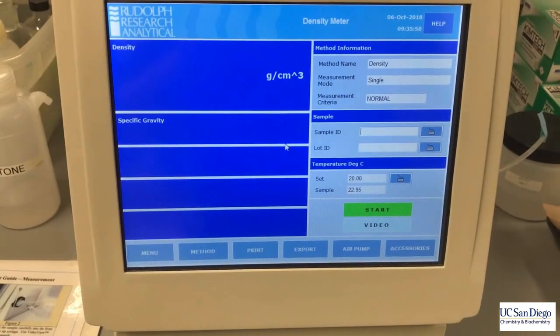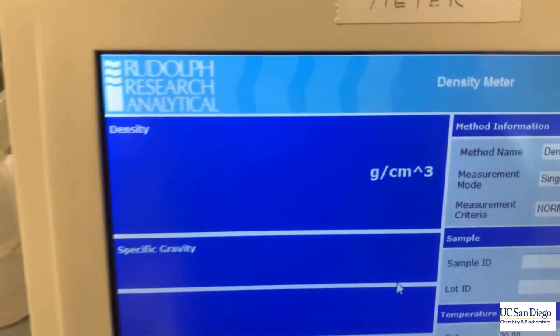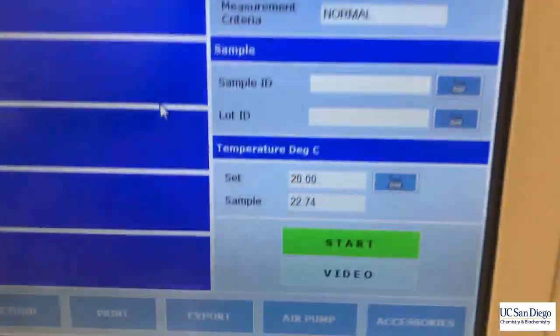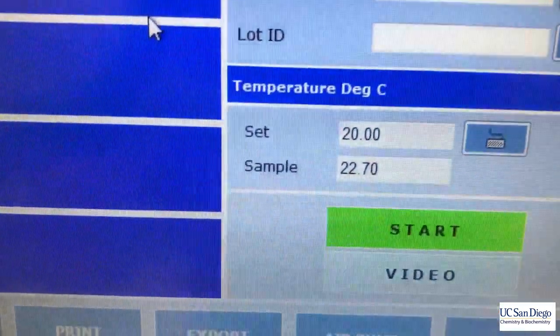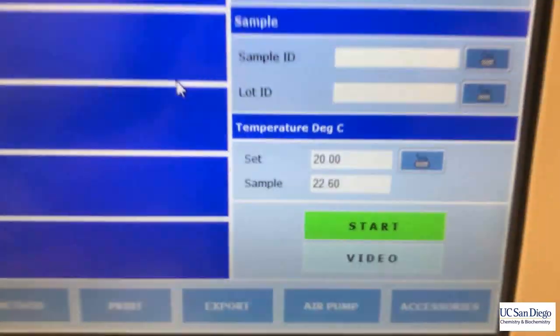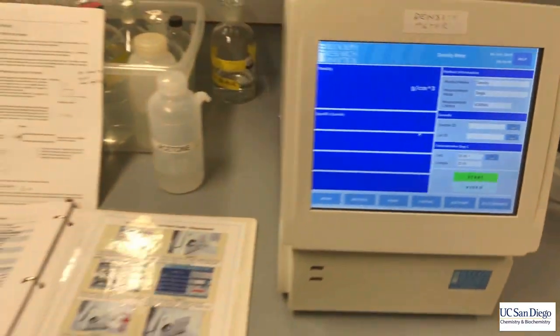Today we'll be learning how to use the density meter. Here's where we're going to actually read off our readings. We can control the temperature to one hundredth of a degree Celsius.